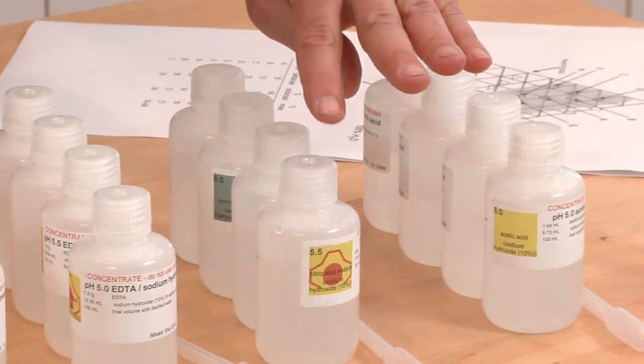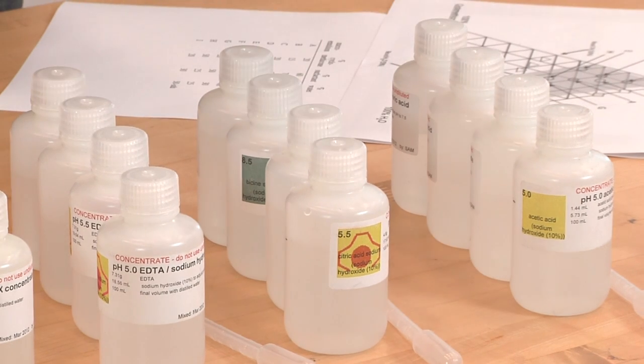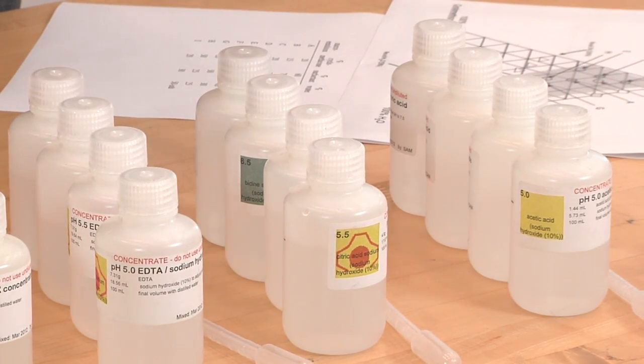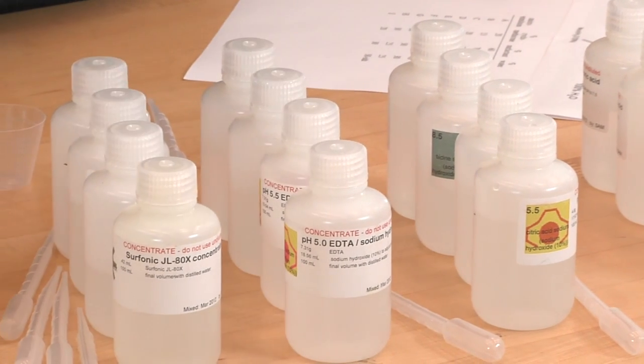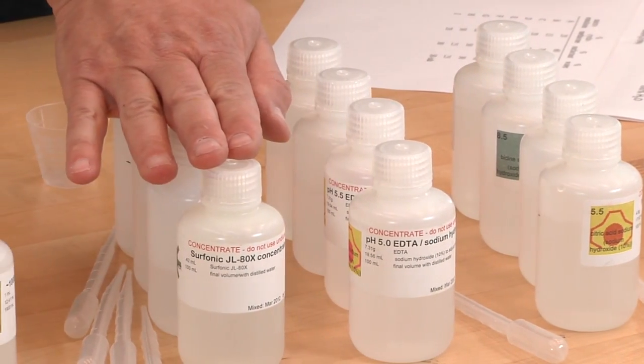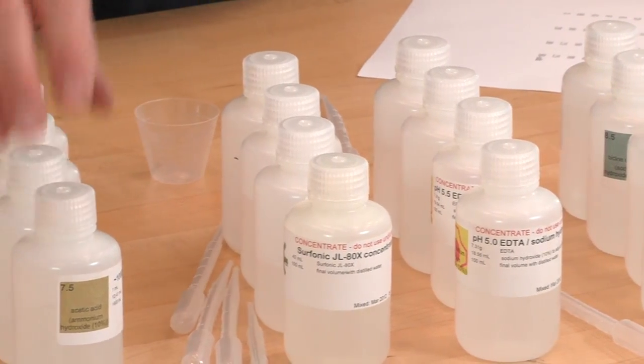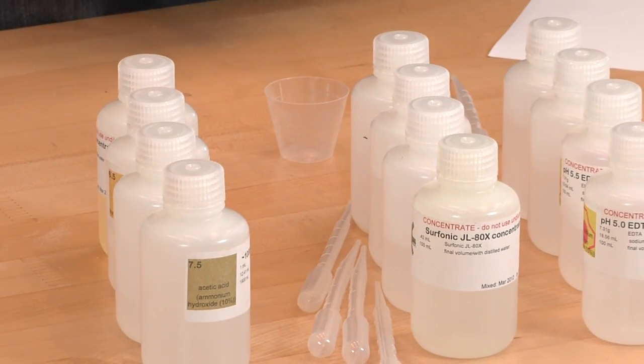Our citrates, same pHs: 5.0, 5.5, 6.0, 6.5. The EDTAs, same pHs: 5.0. And then our surfactants, which we won't be using, and then our rinse solutions that are pH adjusted and conductivity adjusted.